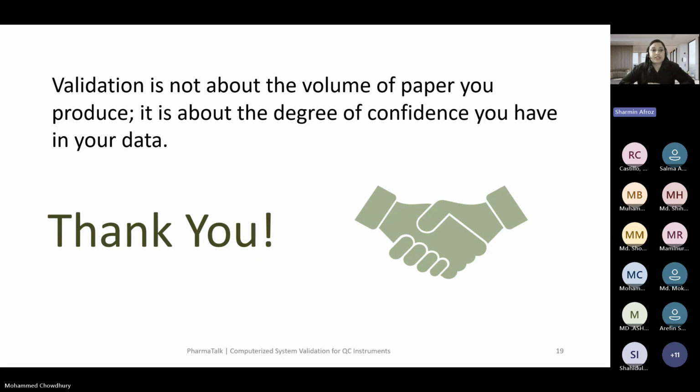In quality control, we don't just generate data; we generate decisions that impact patient lives. So CSV is not just about documentation. It is about trust: trust in your system, trust in your data, and ultimately trust in your product. A system may be computerized and system generated, but integrity is always human controlled. So let's not just validate the system, let's validate our process, our discipline, and our commitment to quality. Validation is not the volume of paper you produce, it's the degree of confidence you have in your data.